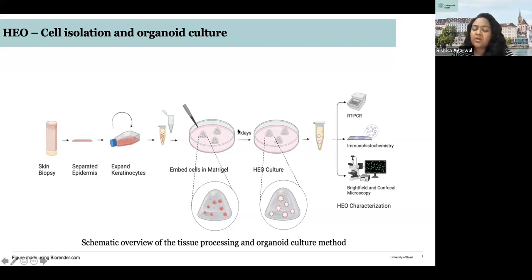We treat them with different growth factors and media. I'll talk about it in the next slide. And in 7 days, these cells essentially grow into these organoids, which can then be collected from this Matrigel and then analyzed for further analysis.